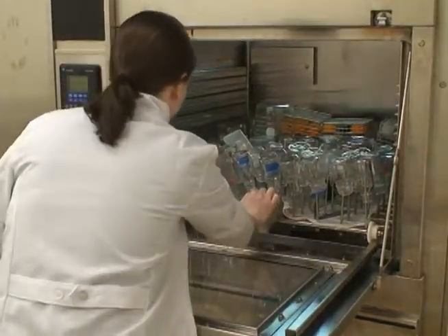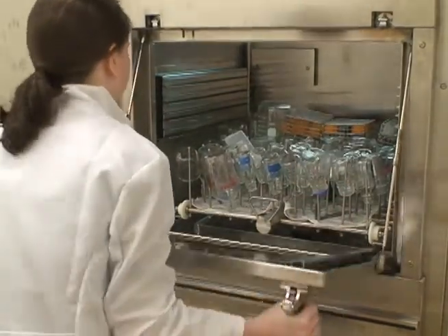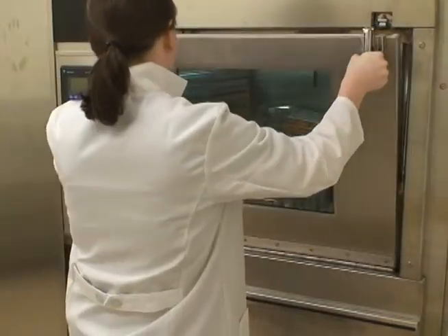Once you've loaded the dishwasher, it's time to start it. You should first push the tray in and then close and lock the door. When you hear a click, that means it's locked.